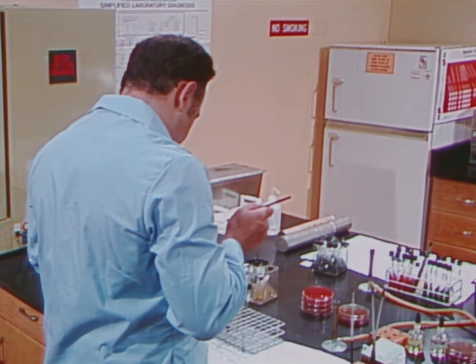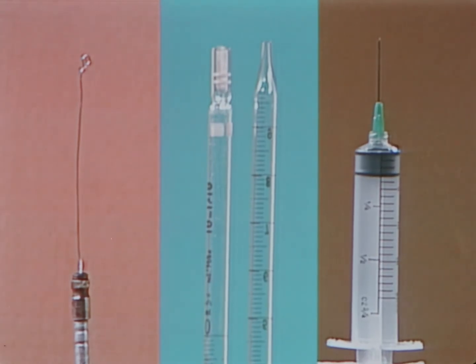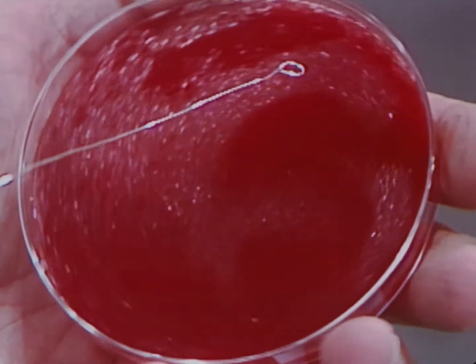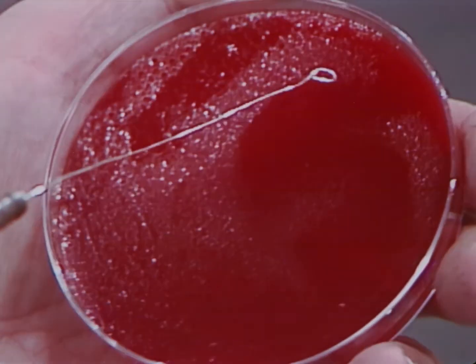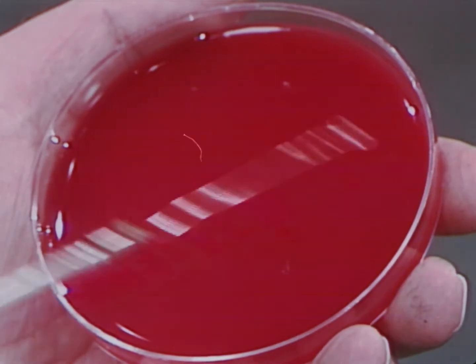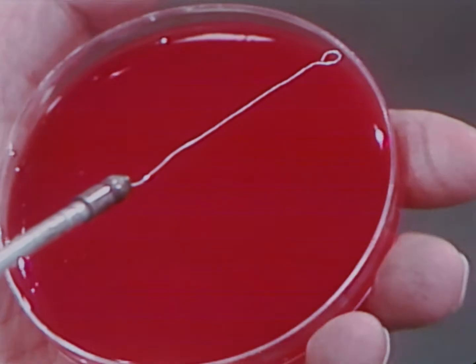Care must be taken with procedures involving the inoculating loop, pipette, syringe, and needle. Frequently, aerosols are produced when the inoculating loop is used to streak an agar plate having a rough surface. Such roughness occurs where bubbles remained in the agar surface while it hardened. Aerosol formation may be significantly reduced by using only smooth, bubble-free agar media.